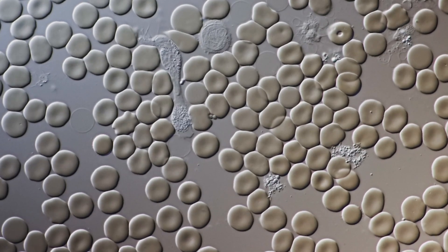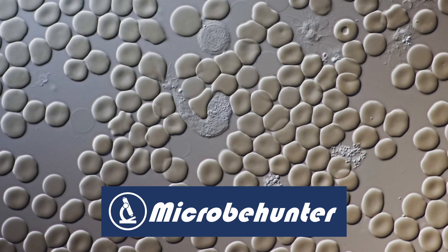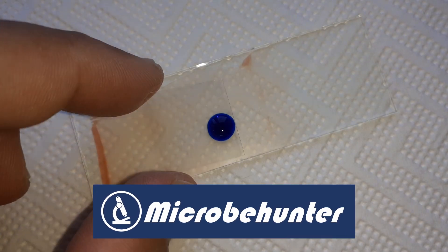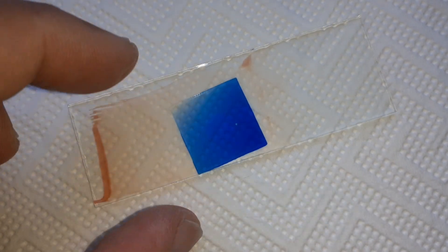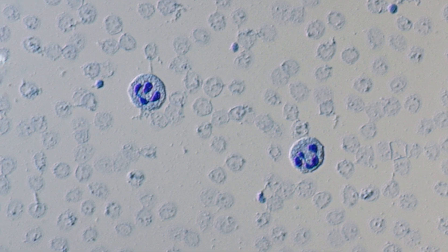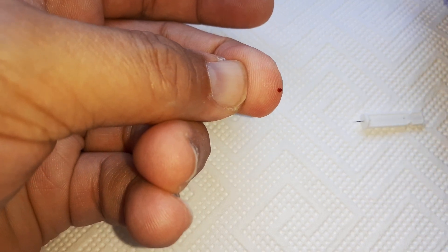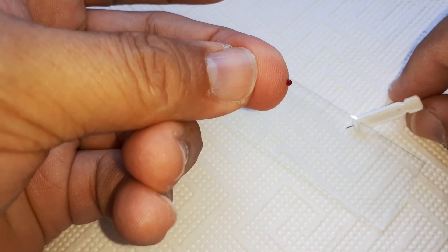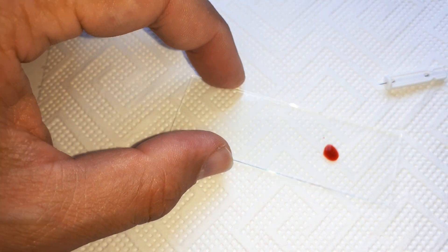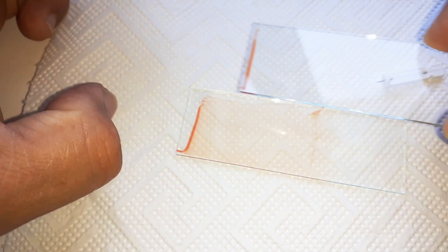It's possible to see white blood cells hunt down bacteria, and I would like to show this to you. I also would like to show you how it's possible to stain the white blood cells to make their nuclei better visible. Hi, hello and welcome again — Microbe Hunter here. Today I'm going to put some blood under the microscope. Here is a small drop of blood, and specifically I would like to focus today on the so-called white blood cells.